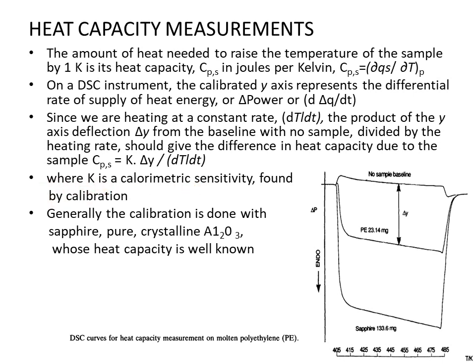Generally the calibration is done using sapphire, which is a pure crystalline alumina whose heat capacity is very well known.